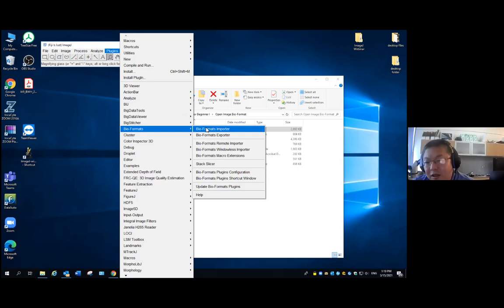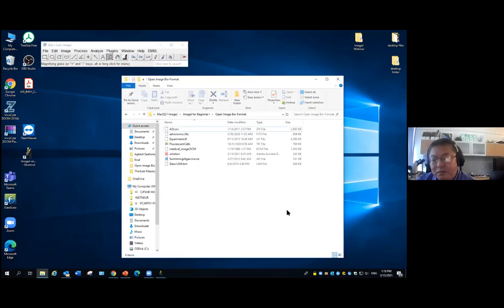I used to do it quite some time ago, several years ago. I sent them a file format, and a few days later, they said you can just update ImageJ again, and then it can open that format. So this is how to open the image. That's actually a very big advantage of ImageJ. It basically can open every single image format you have.